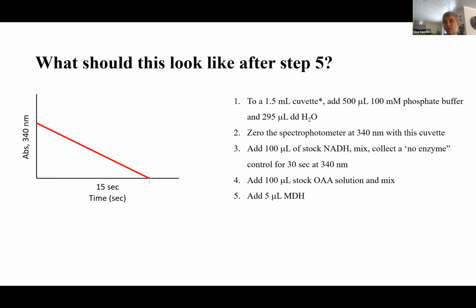It's linear over about 15 seconds, and you can measure the slope of that, and that's your rate. So this is what students are looking for. And again, it's going to take a little bit of time for them to figure out how to get on the curve, but that's what that looks like.